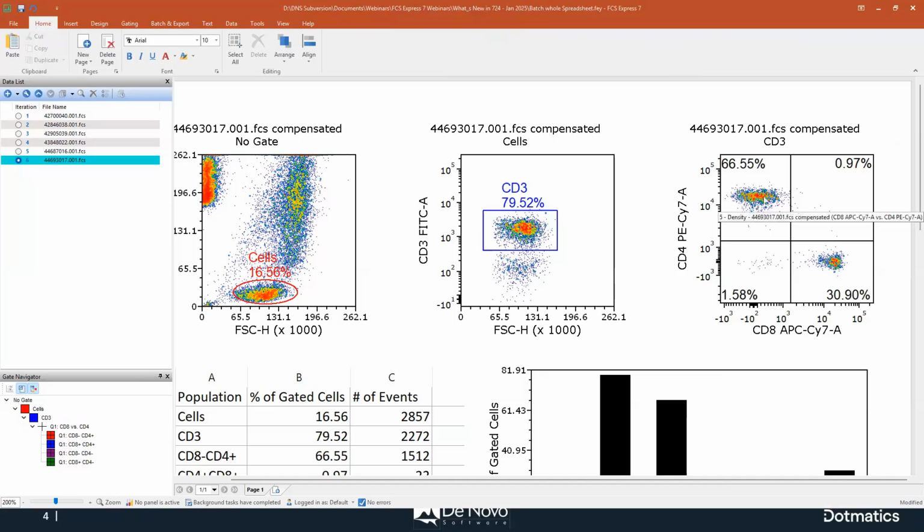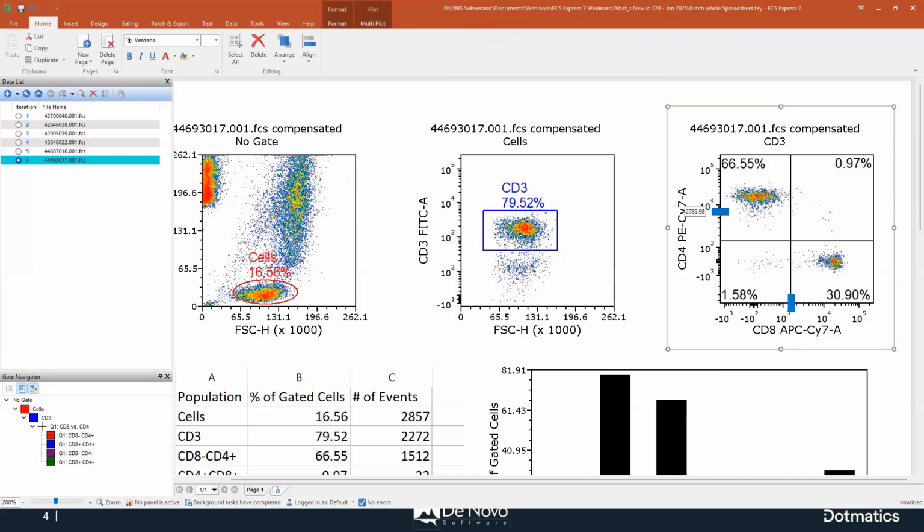If you don't do that, then every time you click on the plot, those sliders will be available and accessible.